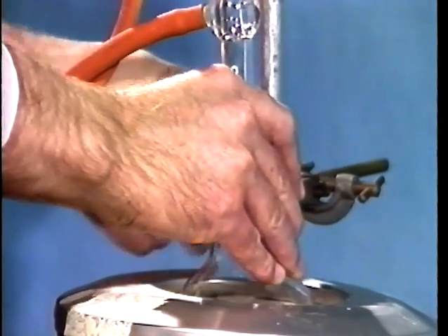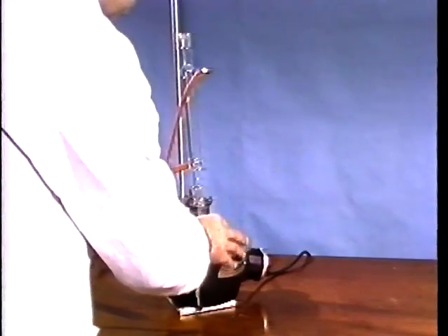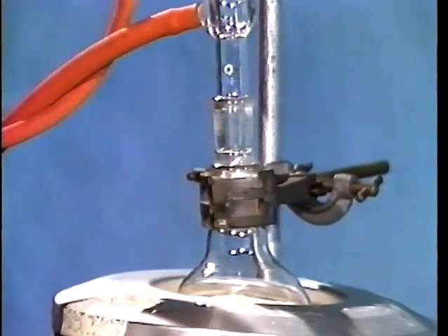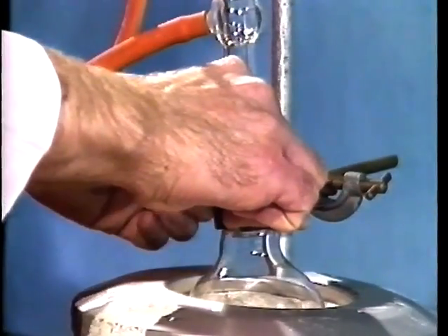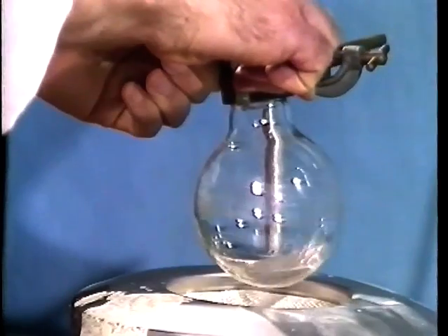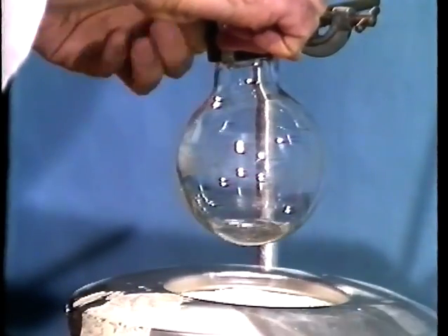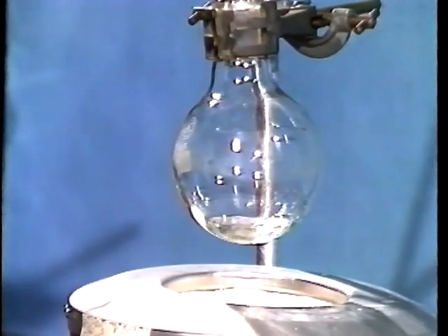And bring this solution to the boil. To the boiling solution, you can see here the solvent is dripping from the bottom of the condenser.